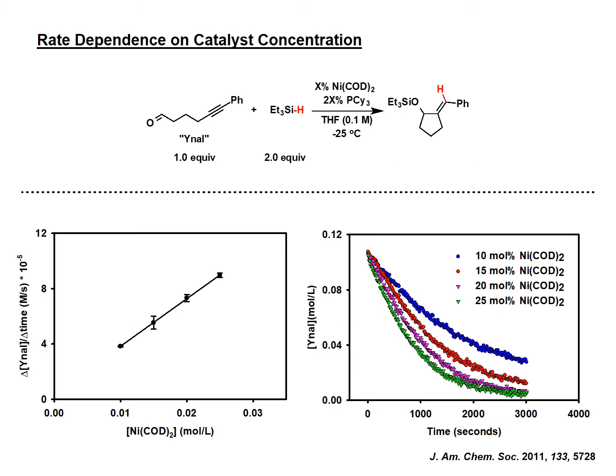We're going to do exactly what everyone learned how to do for initial rate kinetics when they first learned it in organic chemistry or a higher level physical organic chemistry class. We're going to keep a lot of the things the same and change one of the things and see how the initial rate changes when we change the concentration of these species.